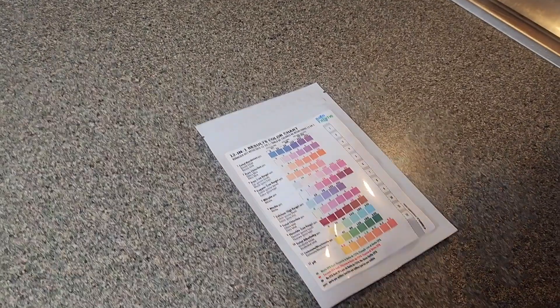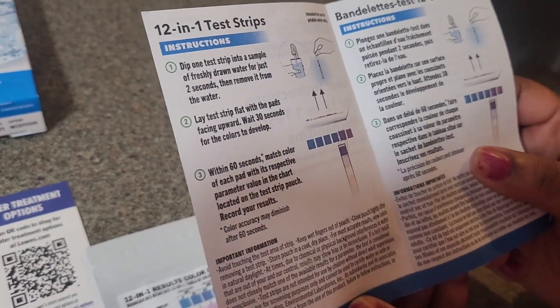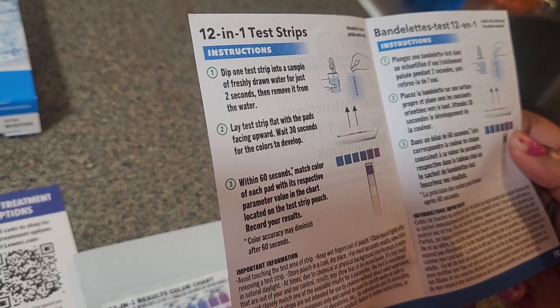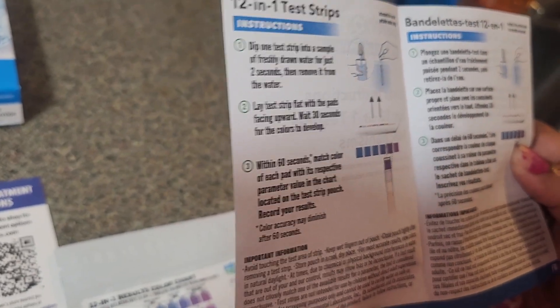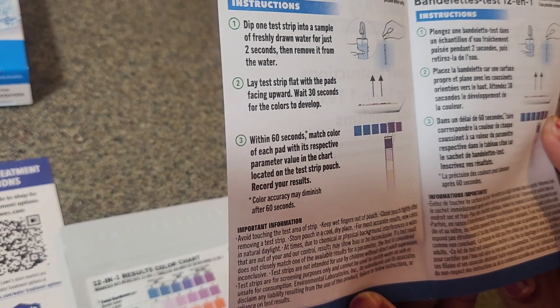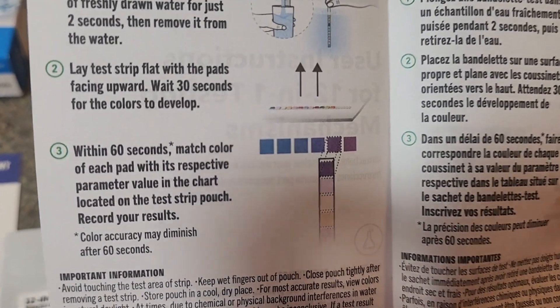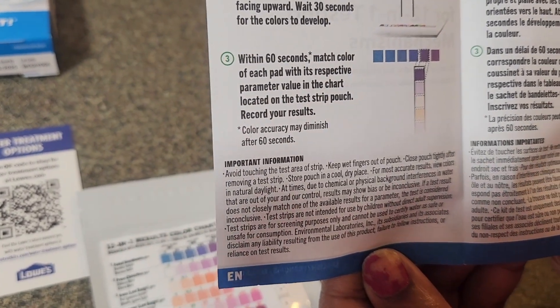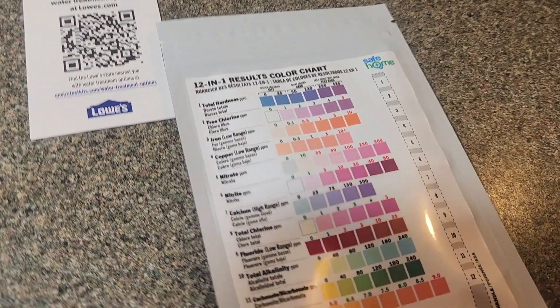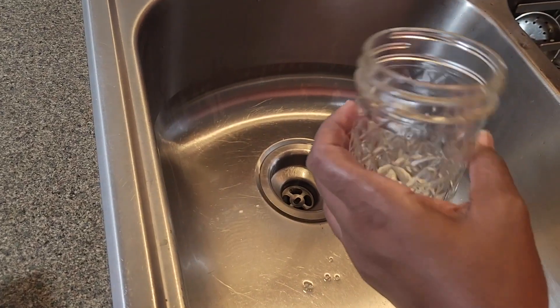Here are the contents inside: a color chart, the direction sheet, and a barcode. Directions say: one — dip one test strip into a sample of freshly drawn water for just two seconds, then remove it. Two — lay the test strip flat with the pads facing upward. Three — wait 30 seconds for the colors to develop. Within 60 seconds, match the color of each pad with its respective parameter value in the chart on the test strip pouch. Record your results — color accuracy may diminish after 60 seconds.